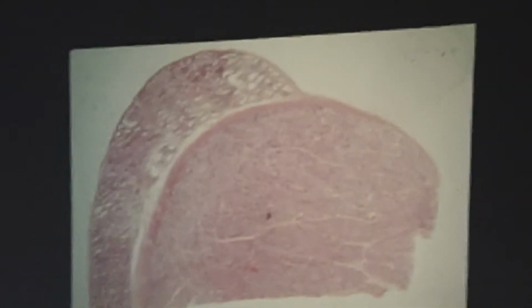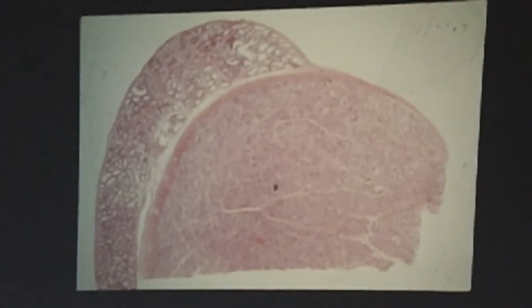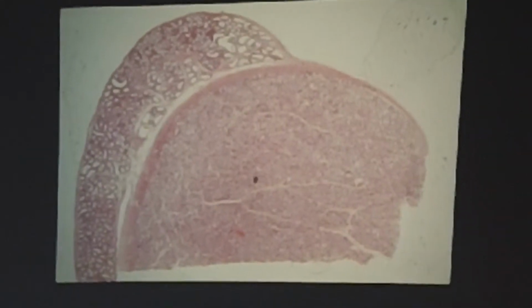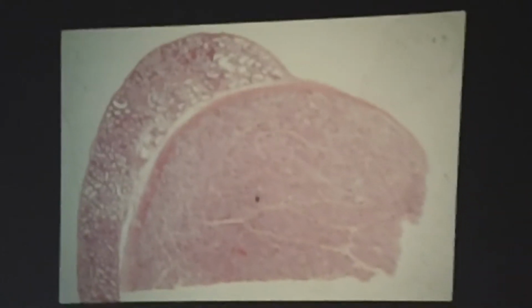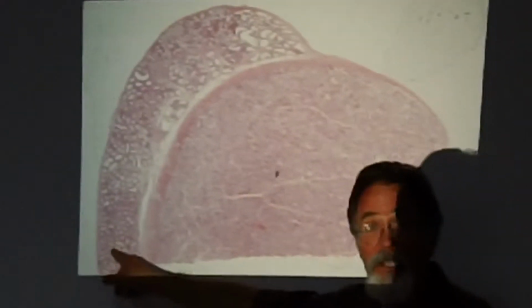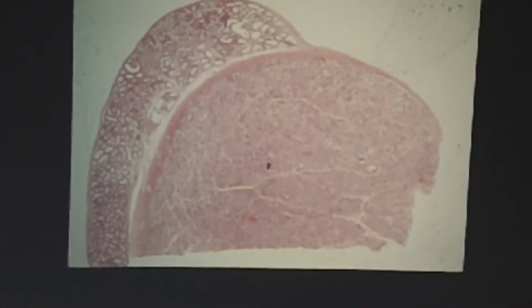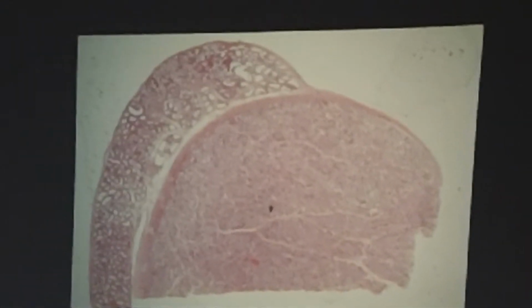All right, moving to the male reproductive histology. Some of you have this orientation, where basically you cut the testes on its long axis, and you can see the epididymis. All right? Many of the slides I looked at were cut this way and didn't have much in the way of epididymis. But it did have a nice mediastinum. I've seen some of the best testes that I've seen in years. So you've got that going for you. You just are missing the epididymis.